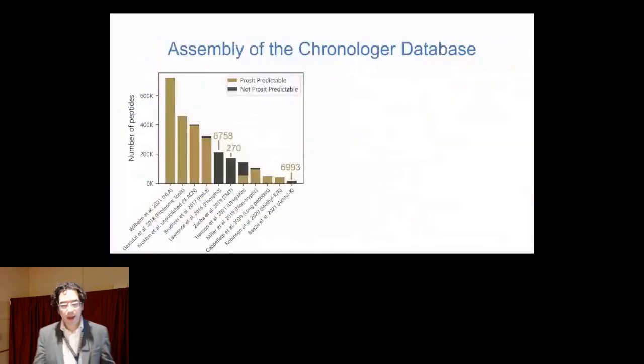And all of these data sets have at least some peptides that correspond to these. Even the phosphopeptide data sets have some peptides that escape that system. Even the TMT data sets, we think of that reaction as being a perfect reaction, that it always goes to completion. It doesn't always go to completion. We can definitely find unmodified peptides in those data sets.